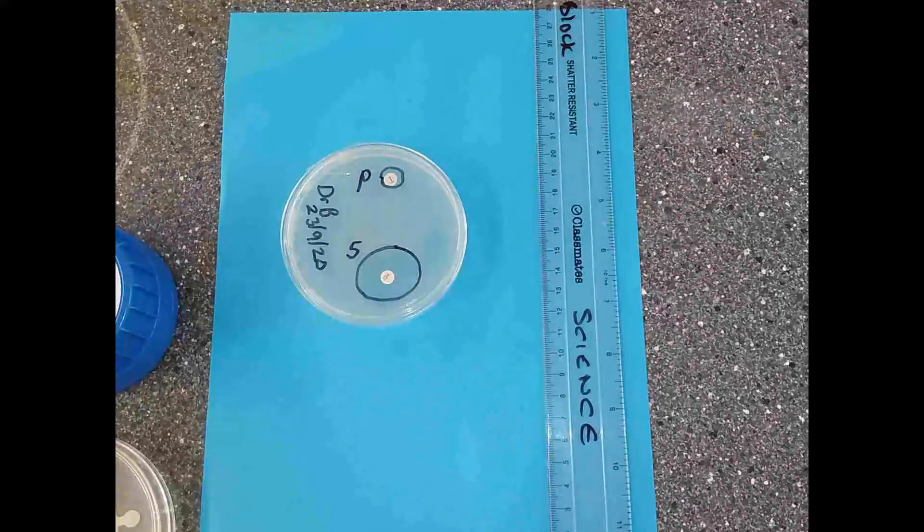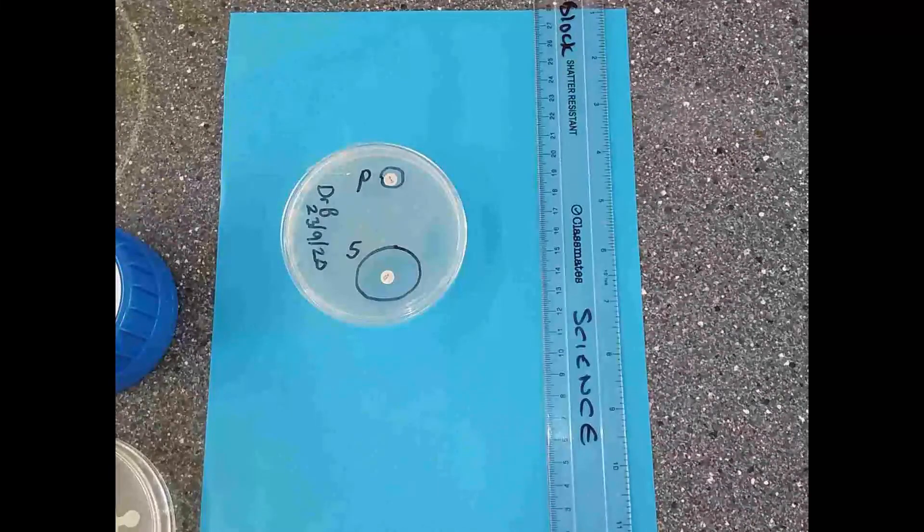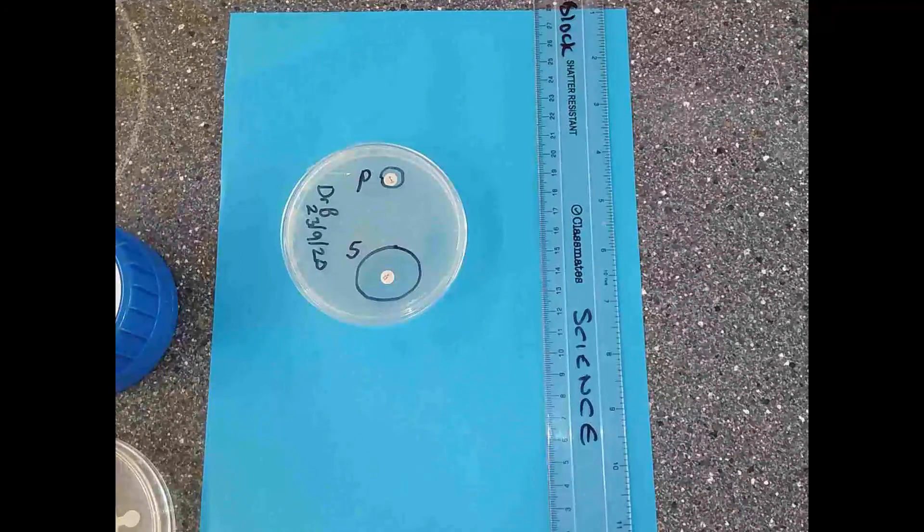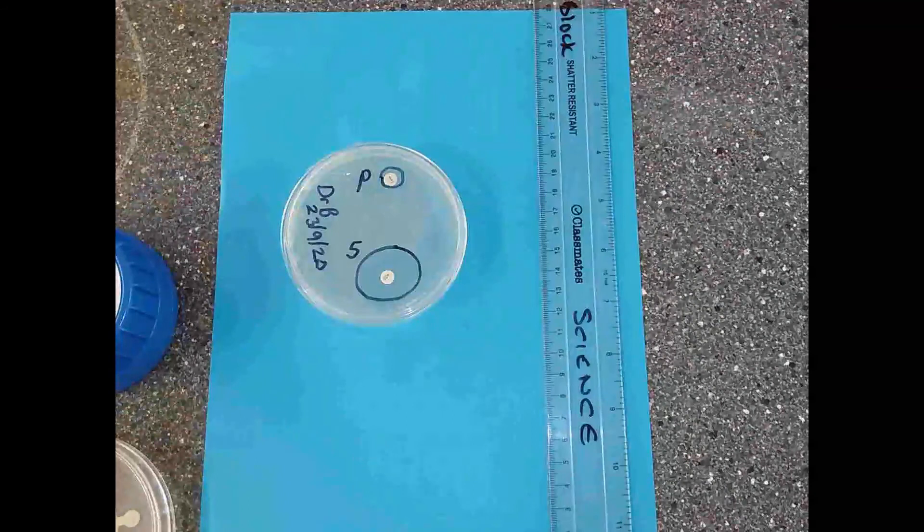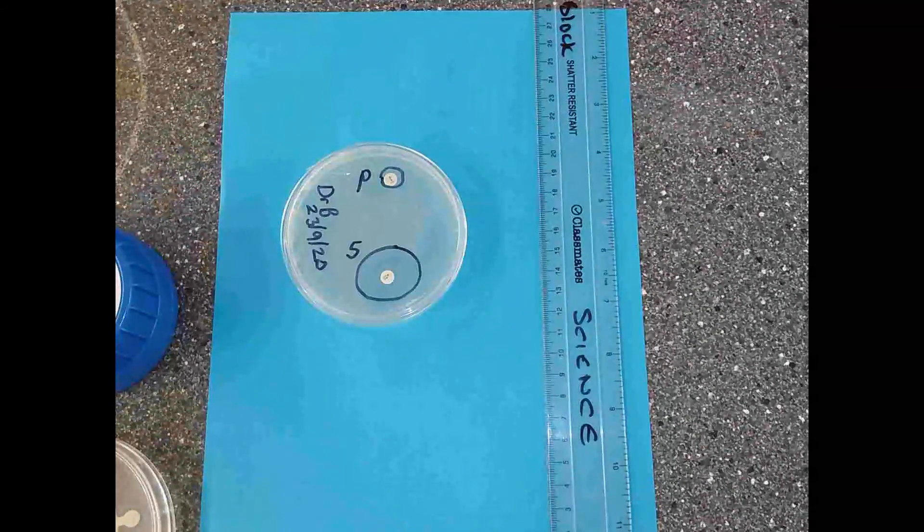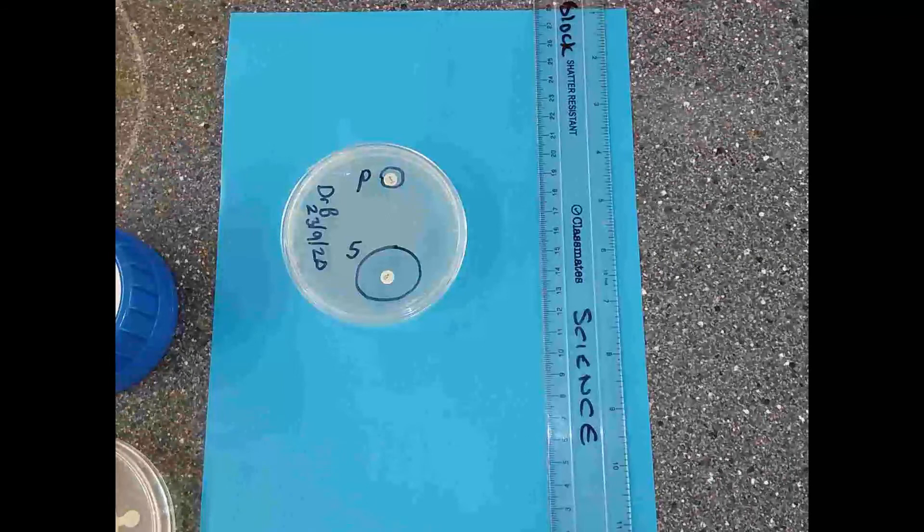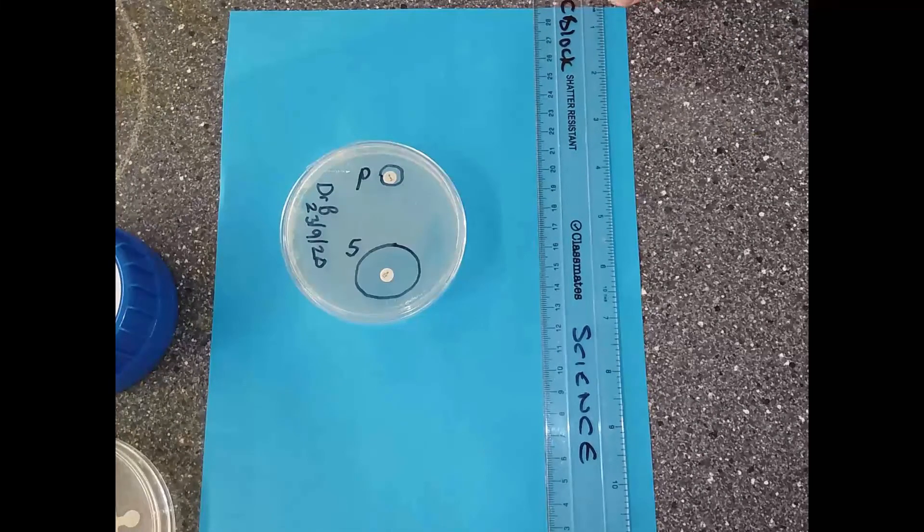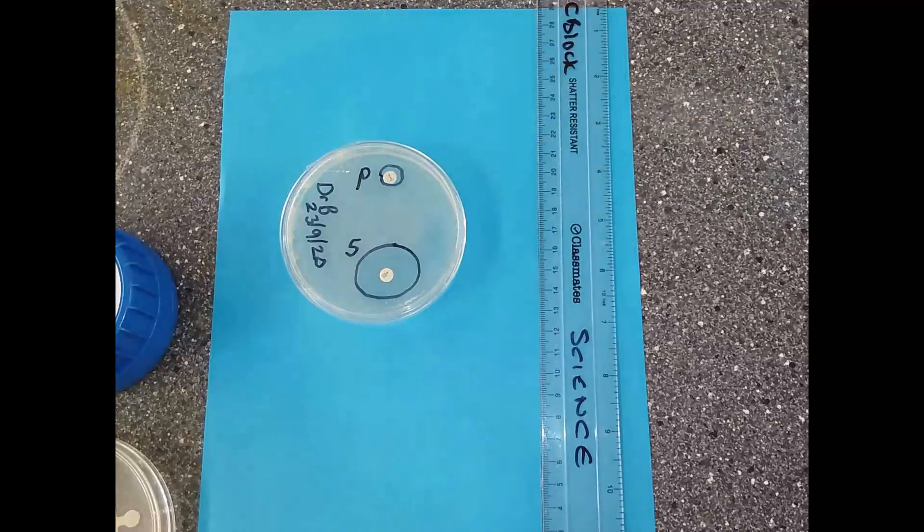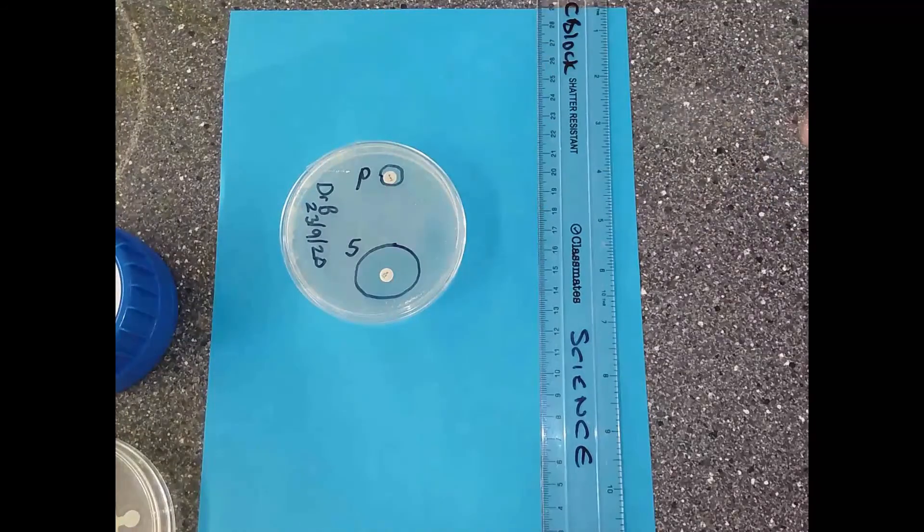Observing that, which is the most effective antibiotic for E. coli? Streptomycin. Why do you say that? Because there's more clear space around it. Yeah, there's a larger clear space. We can do observations like that, but because we're scientists, we need to measure the zone within which the bacteria have died. We can't count the bacteria because there are literally millions of bacteria.